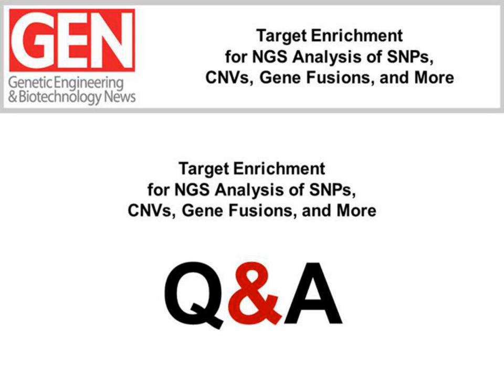So this is Steve. I'll take that one. There isn't a technical limitation on the size. As we discussed during the webinar, we've done capture work down to a few kilobases. We've done experimental work up to 11 megabases internally, and we believe that we can go higher in terms of the upper limit of the target region.